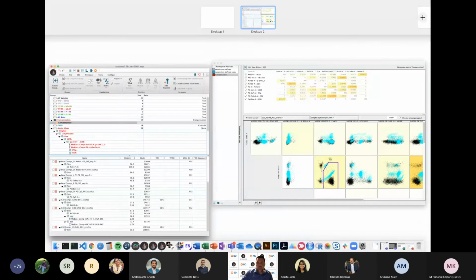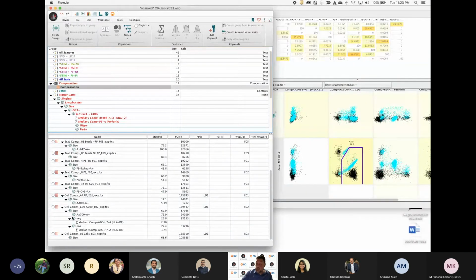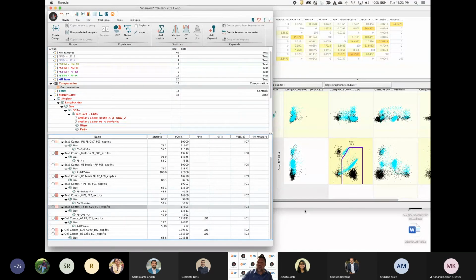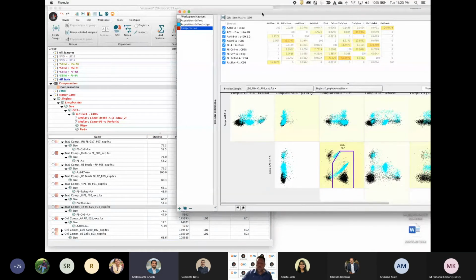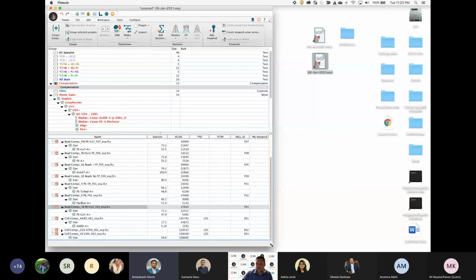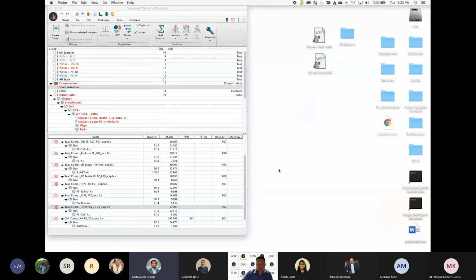Amlan, I am done with this compensation spiel, and I hope that was helpful. Are there any immediate questions that I can address, and then I will go into a quick intro to plugins setup for you guys. I think for the sake of time, we can have the live poll right now on compensation, and then we can directly go to the plugin setup. Sounds good.